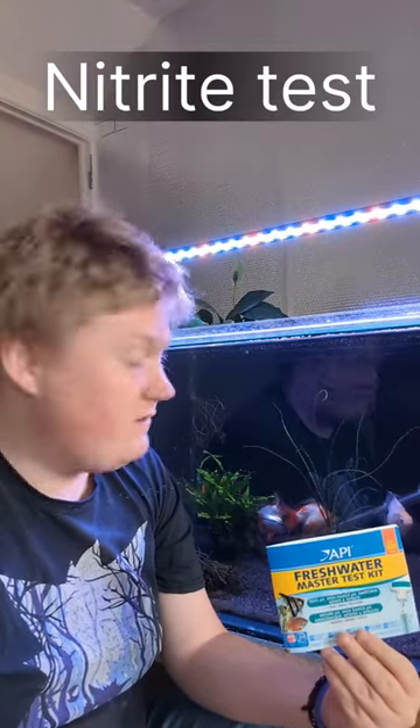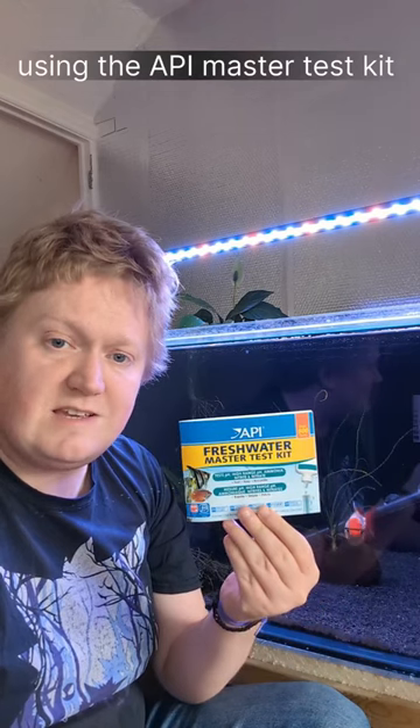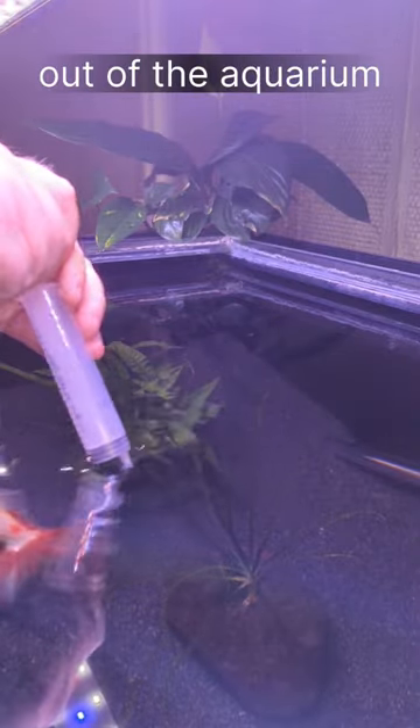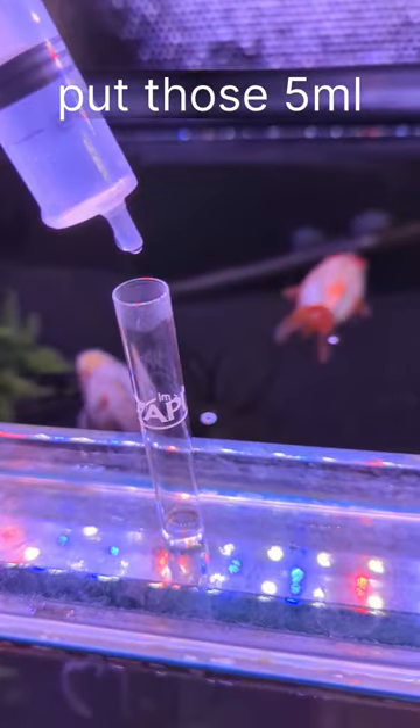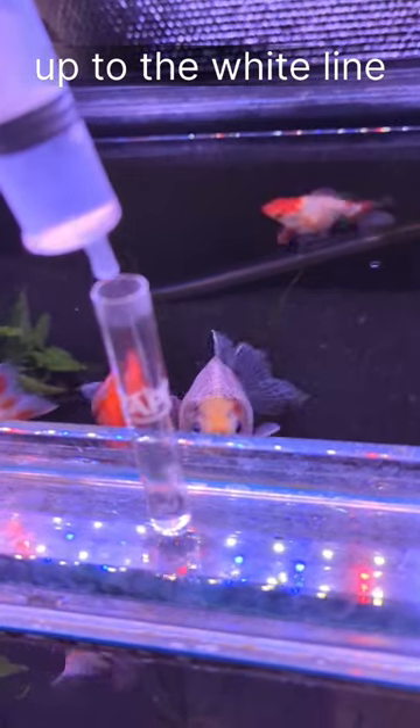We're going to do a quick nitrite test on my goldfish aquarium using the API Master Test Kit. Take five millilitres of water out of the aquarium and put those five millilitres into the test tube provided, up to the white line.